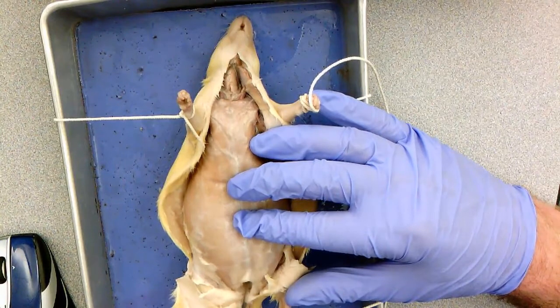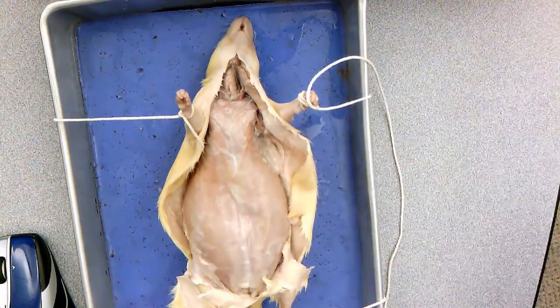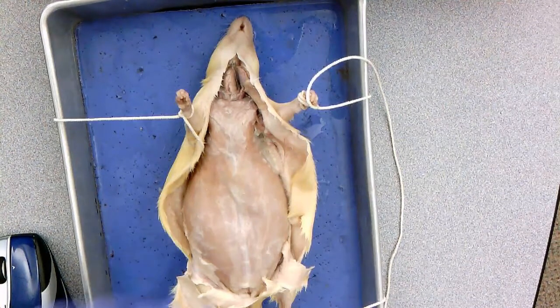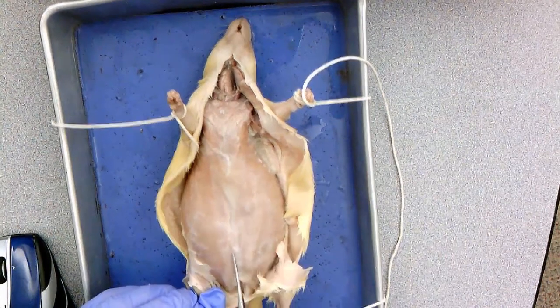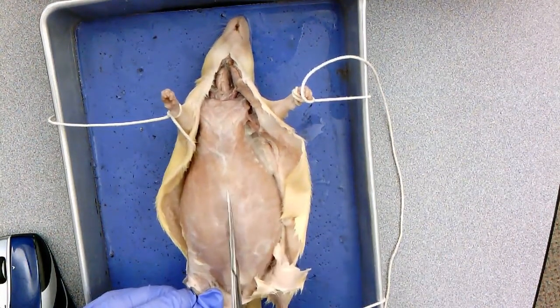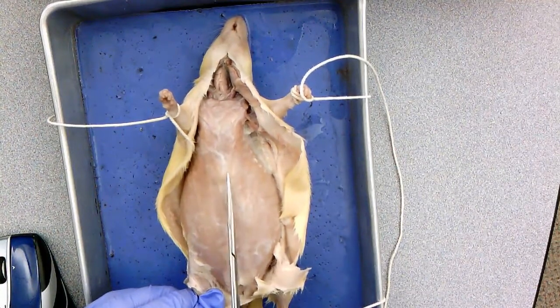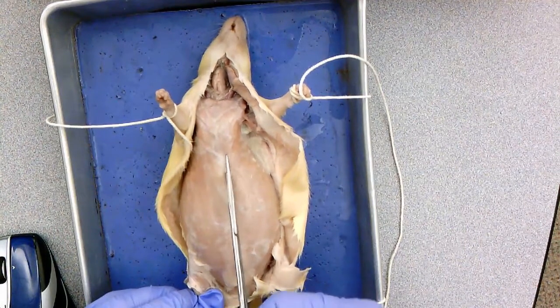All right, so I have my small incision started. I'm not going too deep. I'm going to insert my scissors and cut upward. So I'm going to make this vertical cut right here, in an upward fashion this way. That's all that I'm going to do, and I'm not destroying the underlying organs. That's a big key. I don't want to destroy those underlying organs that are there.